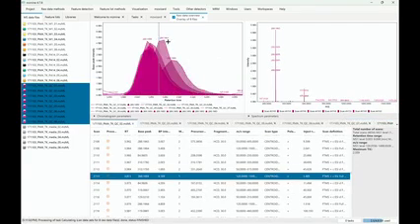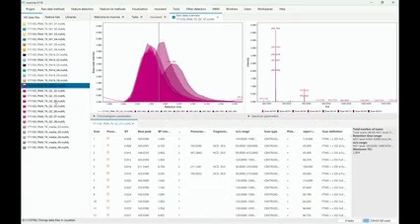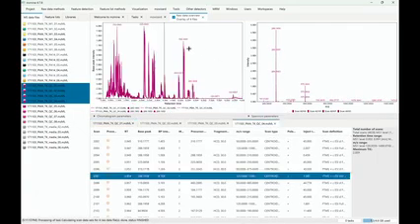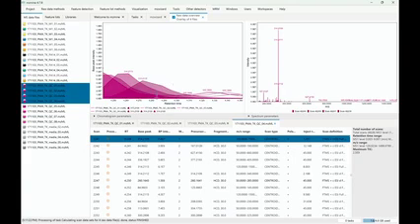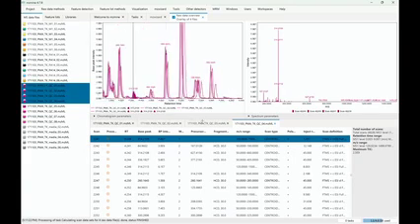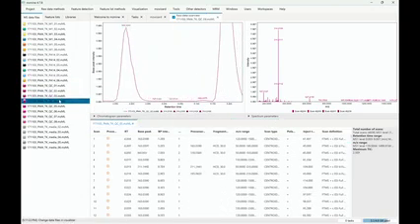And now we can actually see that there's a shift in retention time for 2 of these samples. If I single out those samples by clicking again 1 and 2 and maybe 4, I can click somewhere and I see that it's actually the first 2 samples that are shifted. Yeah, it's the first 2 that are shifted, and I can see that by going through the samples a little bit here. So during the analysis, we might want to exclude those, of course.